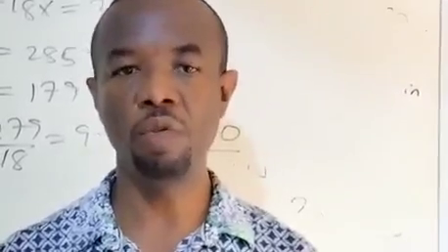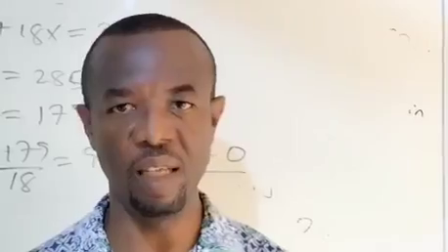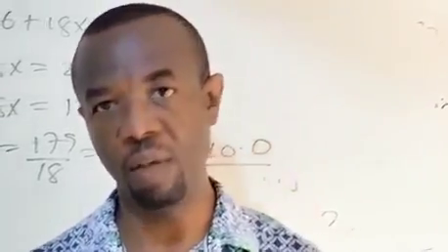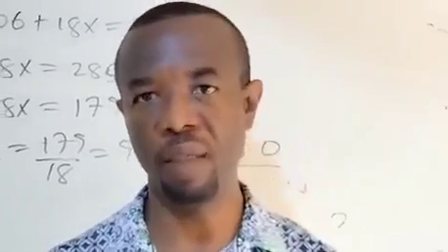So very soon we're going to provide the qualitative analysis, that is the test for the anion and cation, that is specimen F, which we're going to do for this Alternative B Practical Chemistry.